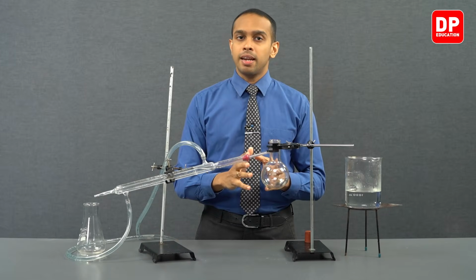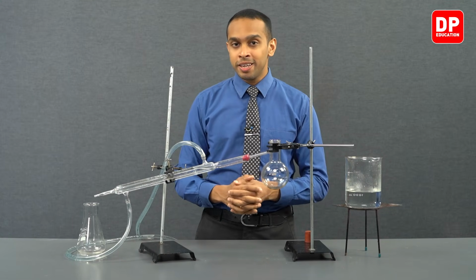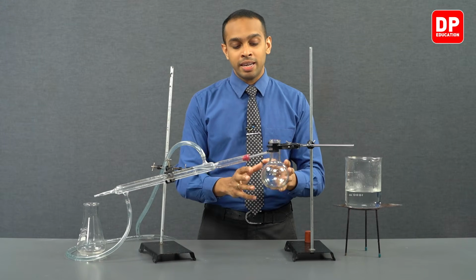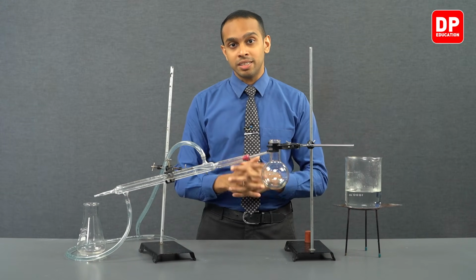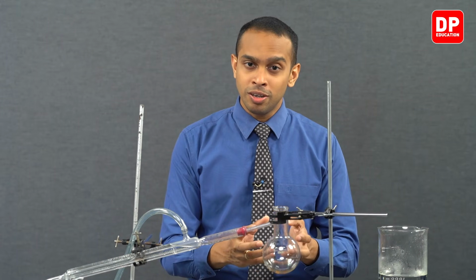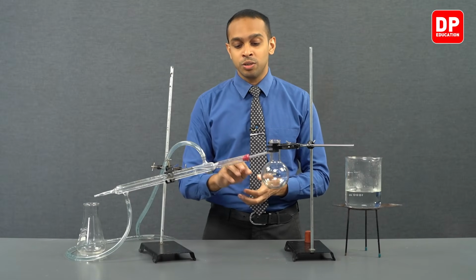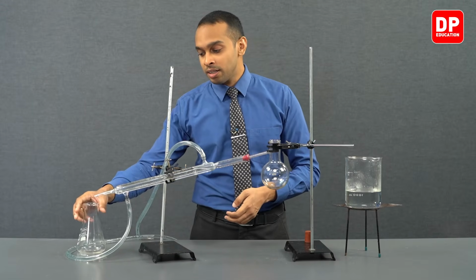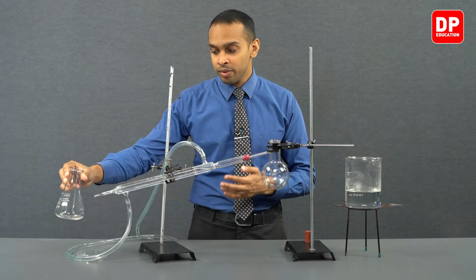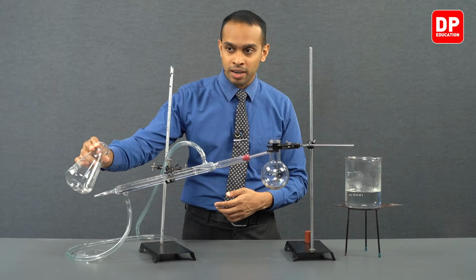As we were carrying out the simple distillation process, to this distilling flask we added a diethyl ether layer that had this essential oil dissolved in it. So as we were heating this distilling flask, we saw the diethyl ether was getting evaporated and was directed towards this Liebig condenser, and it condensed the diethyl ether, and a small portion of this diethyl ether that was produced is collected over here and is present in this Erlenmeyer flask.